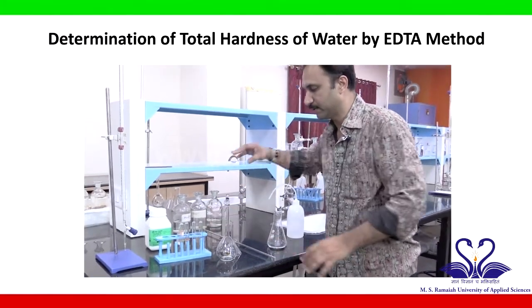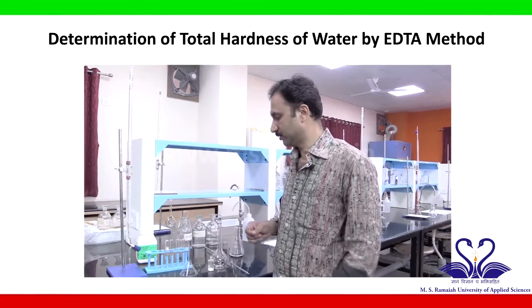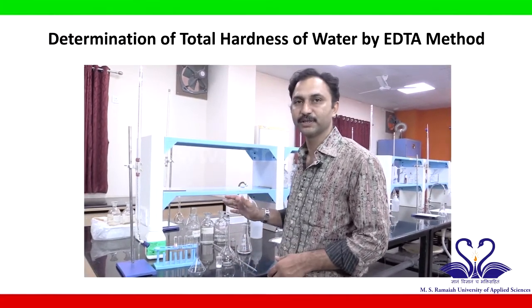Now all my glass apparatus are washed and kept. So all the glass apparatus is washed with tap water and then rinsed with distilled water.